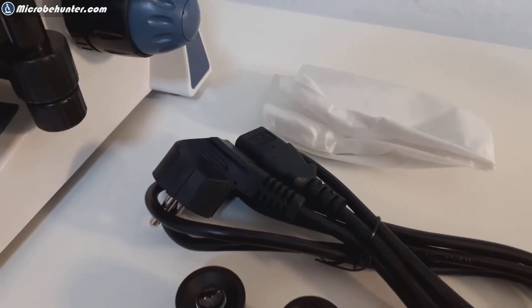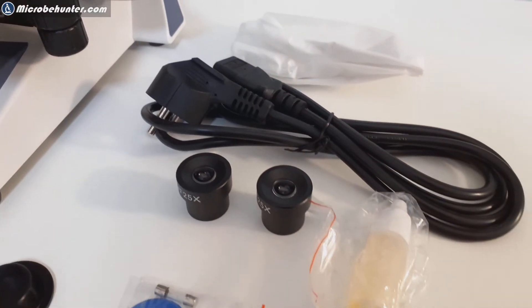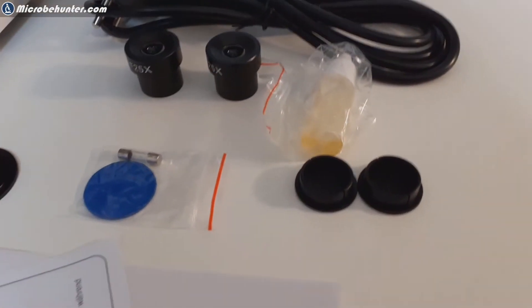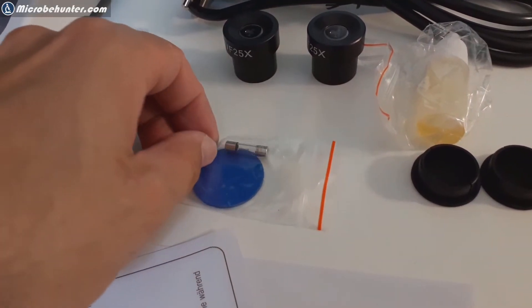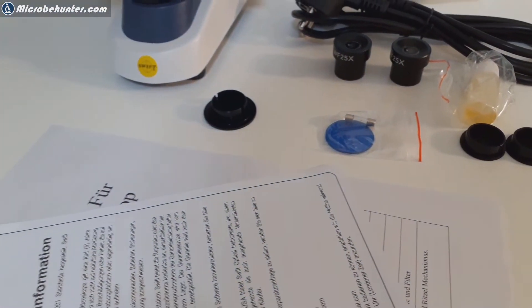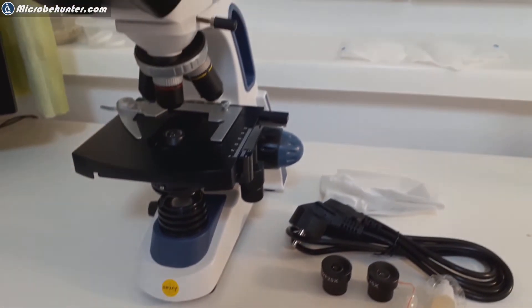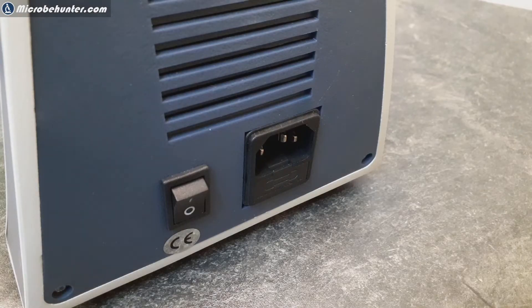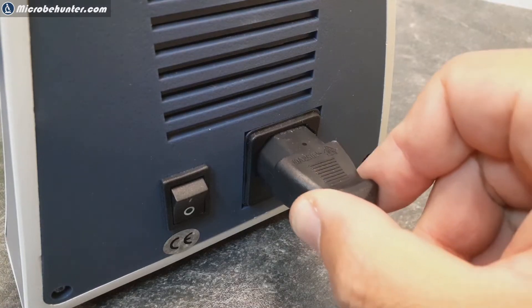This is a piece of paper for protecting the lens. That is basically what's all included here. Immersion oil is included and they also included a fuse and a blue filter because the microscope of course also has a filter holder.